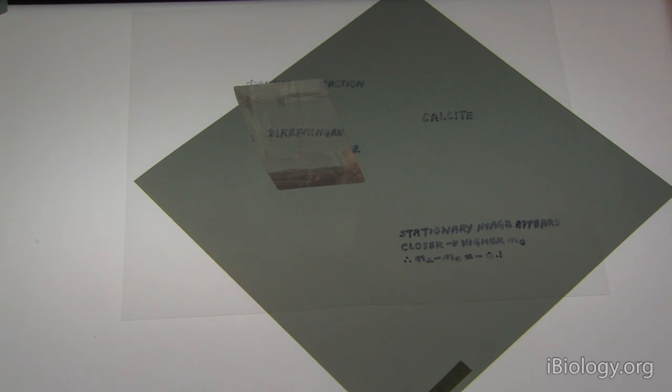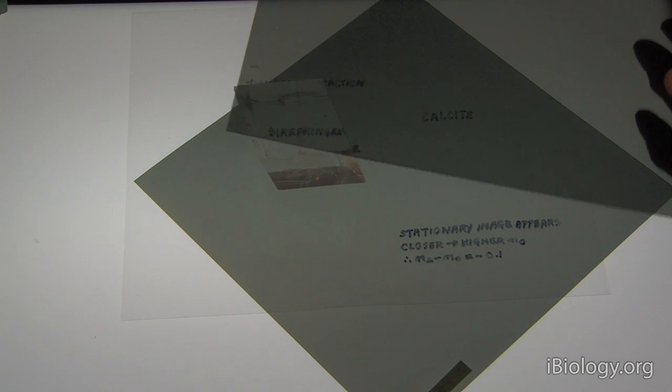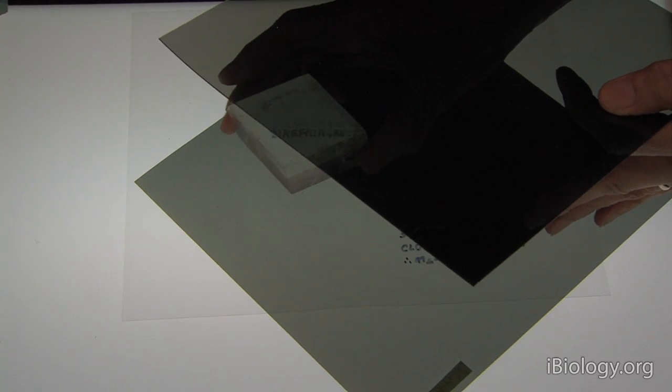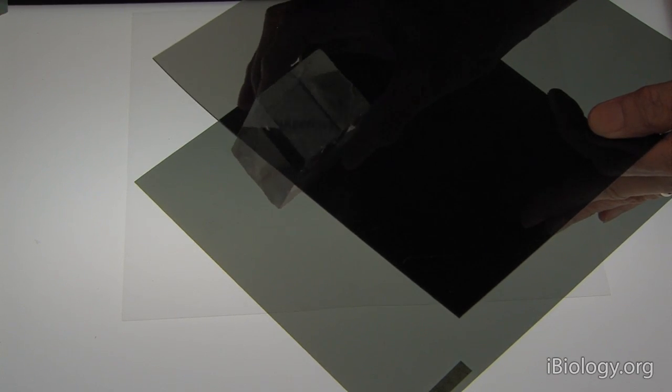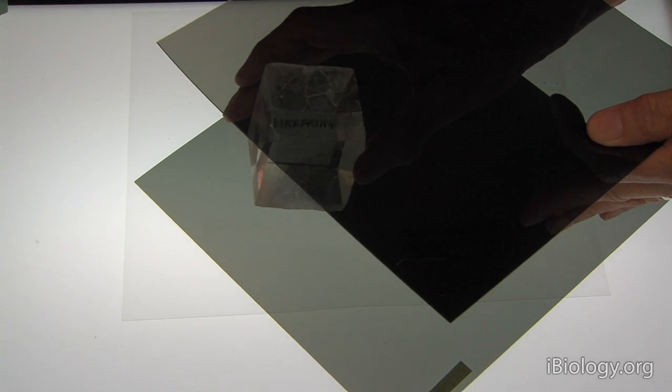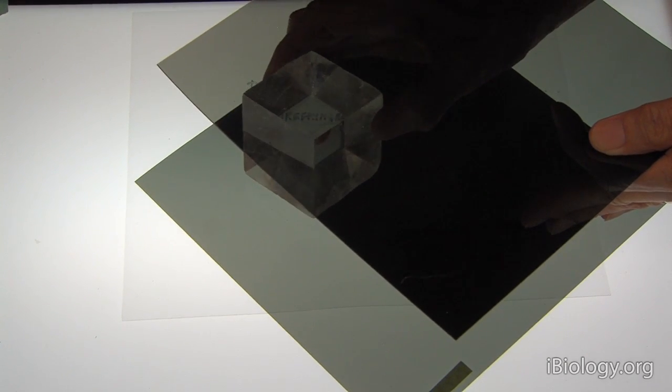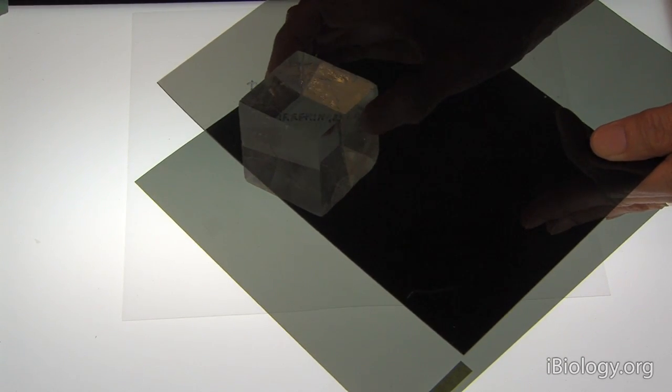Now, when we put a second polarizing material above and cross the two, we still see the birefringent material. As I turn the crystal, the image becomes brighter or darker. This is the property of birefringence.